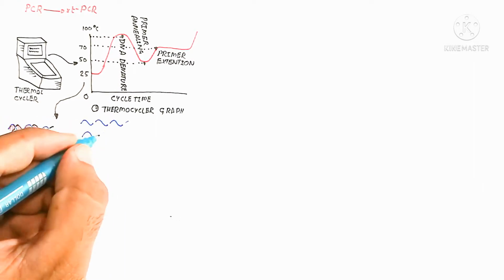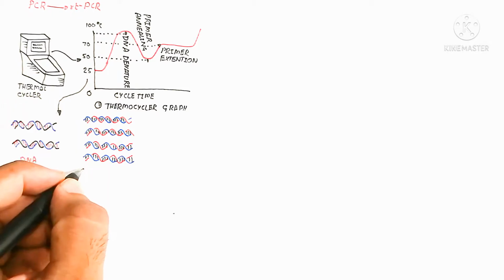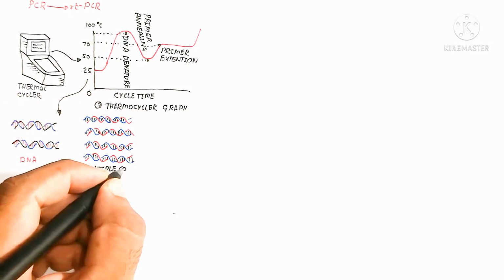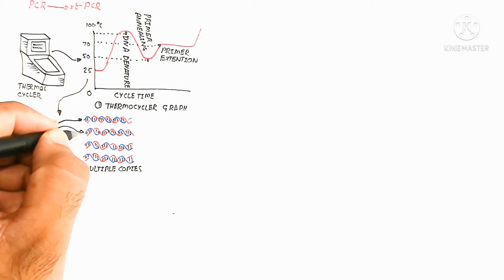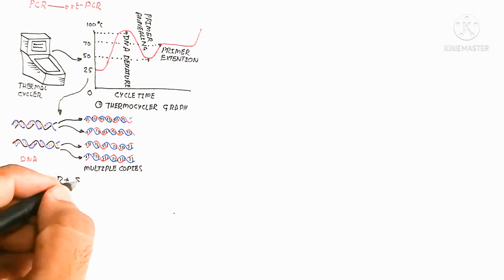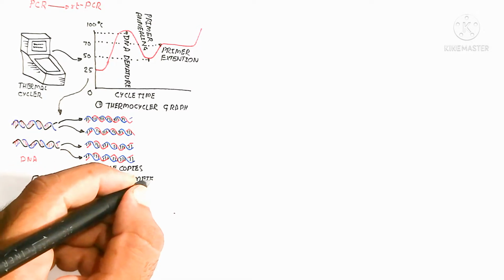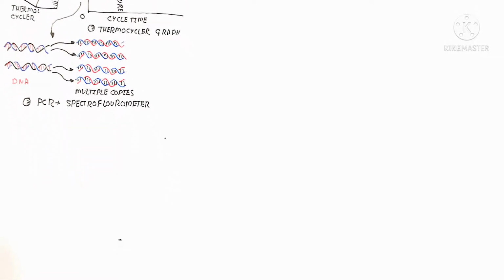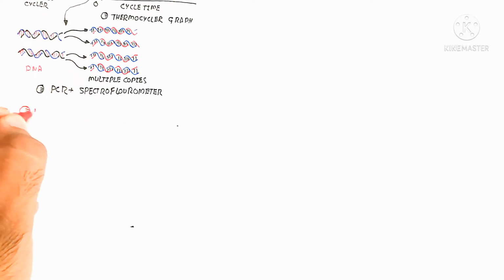The primer is the specific primer used for the DNA amplification. So here are two segments of DNA amplified with one cycle, to multiply copies of the same DNA, equal to the parental DNA given by the sample.